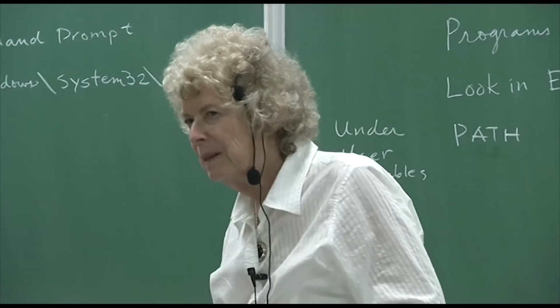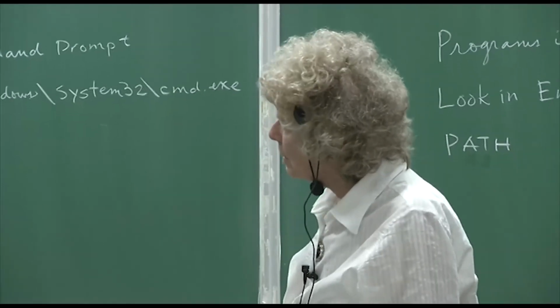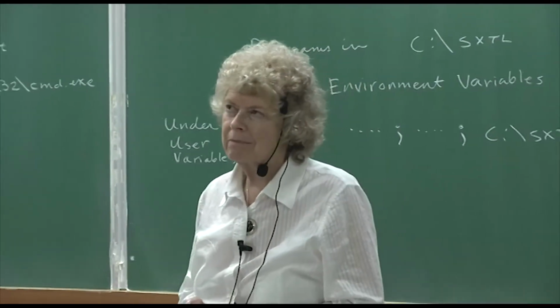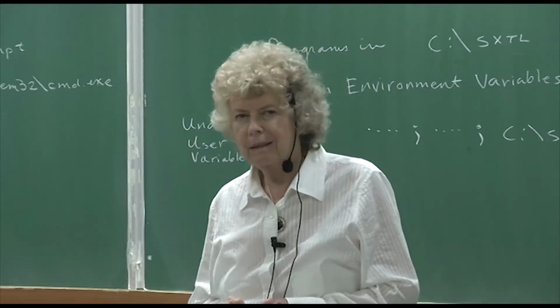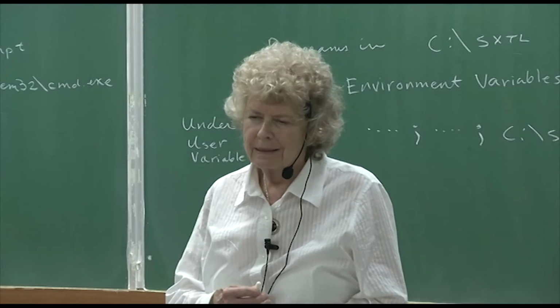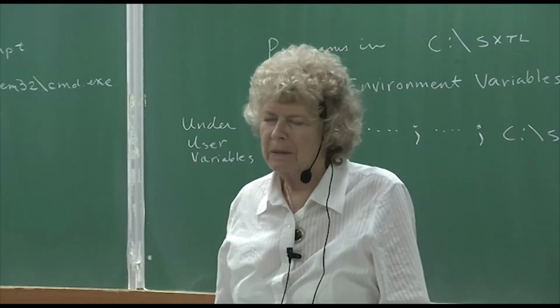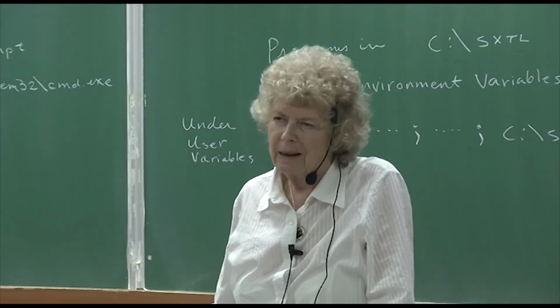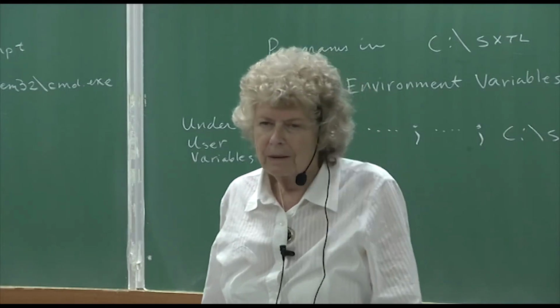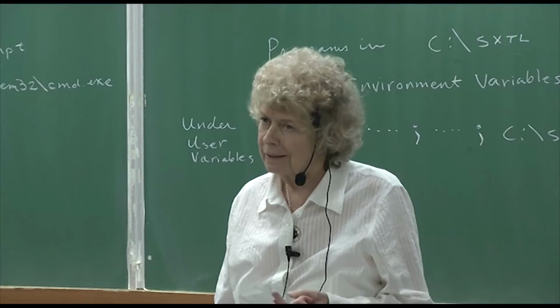Okay, so EADP and ISOR. ISOR is one way to take care of this complaint when you're doing refinement that such and such an atom is NPD, non-positive definite, right? So it means probably that the ellipsoid has a shape that's just so skewed that you end up dividing by 0 and the matrix becomes indeterminate. So non-positive definite. It's usually because either you have too few data or you have a very skewed anisotropic thermal ellipsoid.